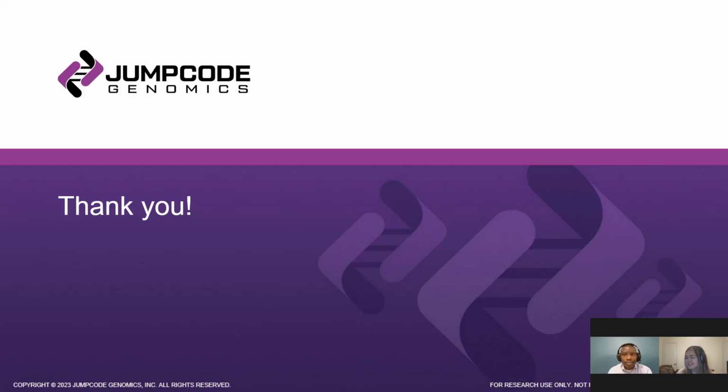Our first question asks, what steps were taken to ensure no microbial sequences were depleted? Yeah, very good question. Thanks for that. Our Jumpcode genomic pipeline uses a very specific guide design pipeline in which the target that we were using in this case was Alu sequence, which is primate specific.